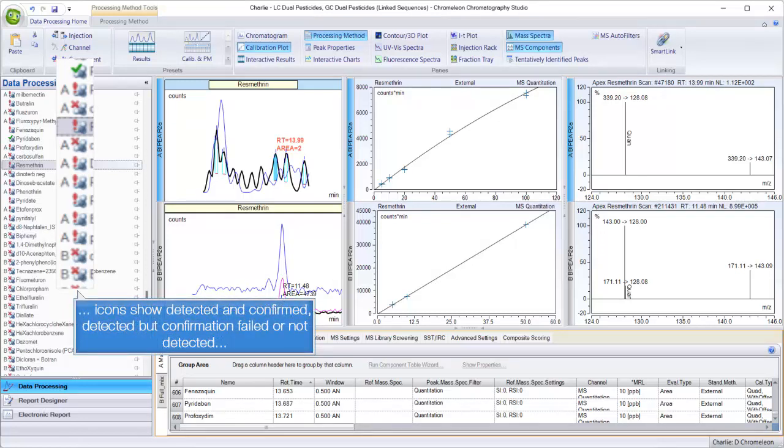Icons show detected and confirmed, detected but confirmation failed, or not detected.